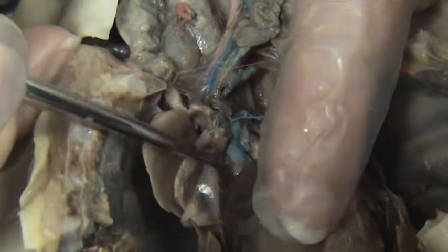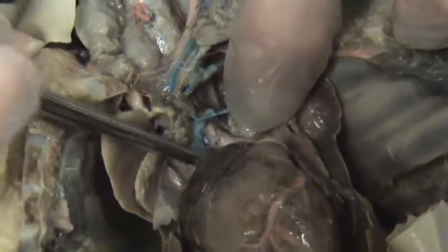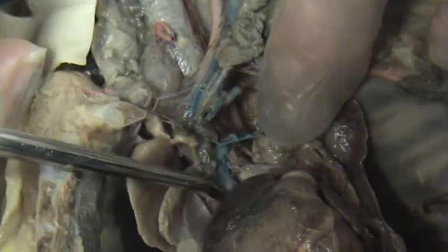What vein goes into the superior vena cava? Superior vena cava. Next to it, it's usually white like this, the aorta. Okay, so superior vena cava, aorta. The aorta is going to form the carotid arteries. The jugular veins drain into the superior vena cava.